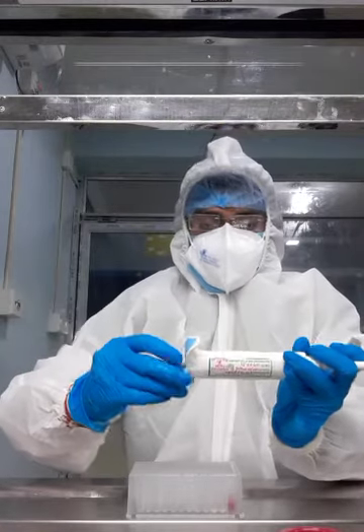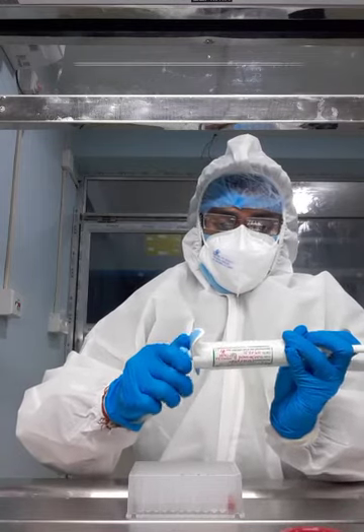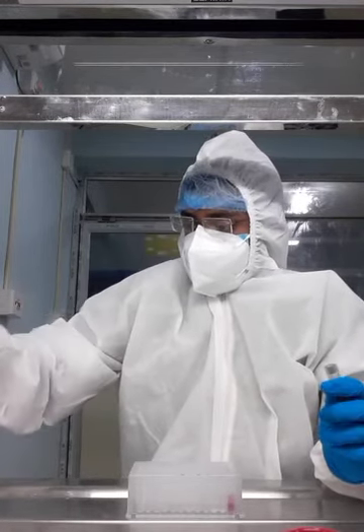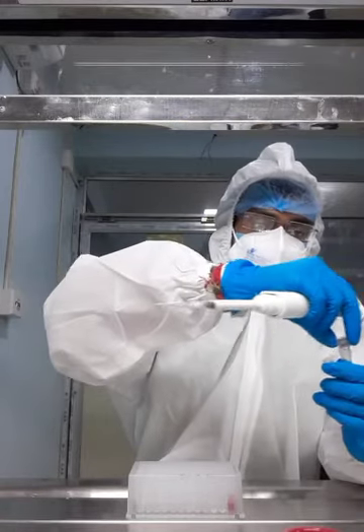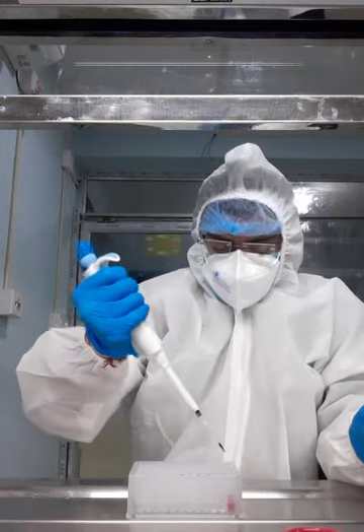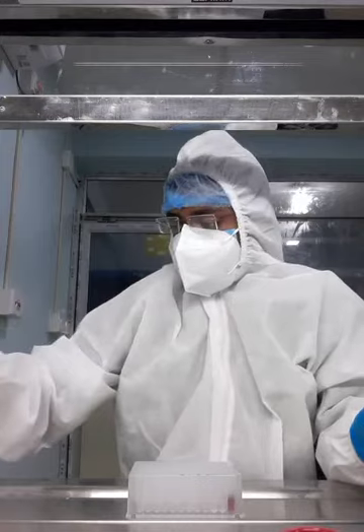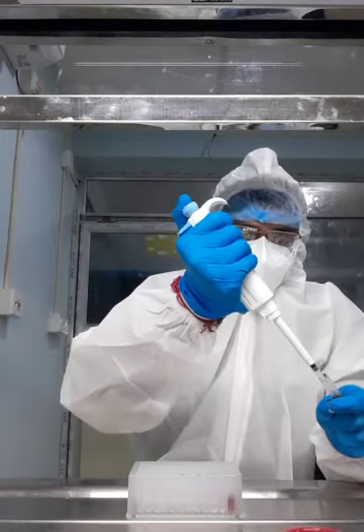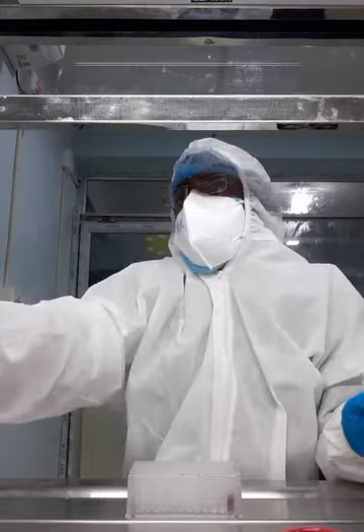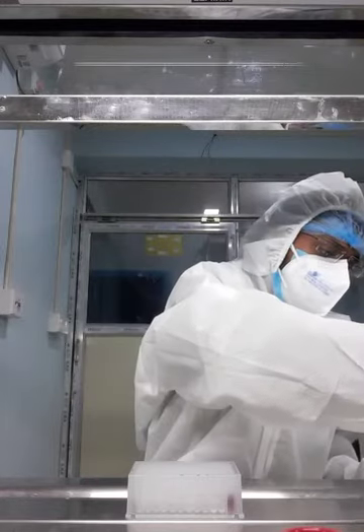Now take 20 microliter magnetic bead and put it in the first column of patient A. Then again take 20 microliter magnetic bead and put it in the first column of patient B. Then discard. Now the first process for RNA extraction is complete.